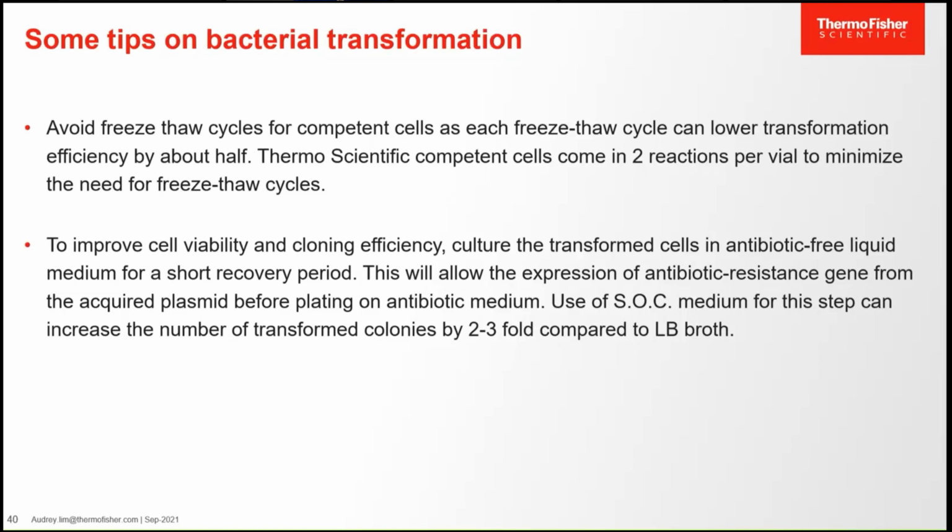This will allow time for the antibiotic resistance gene from the acquired plasmid to be expressed first. And we recommend you use SOC medium, which can increase the number of transformed colonies by 2 to 3-fold compared to LB broth.